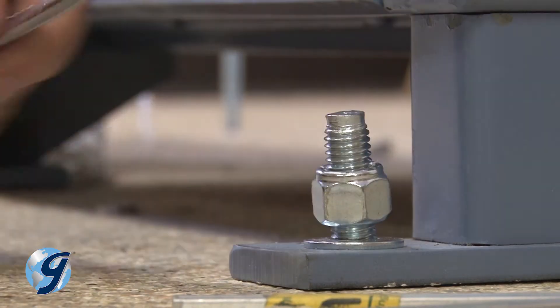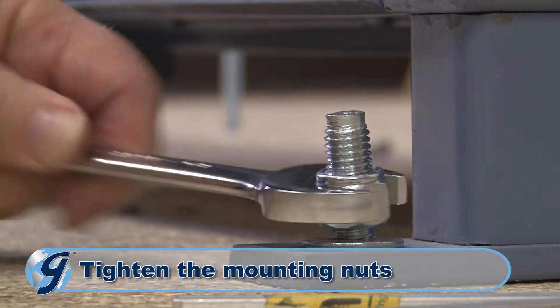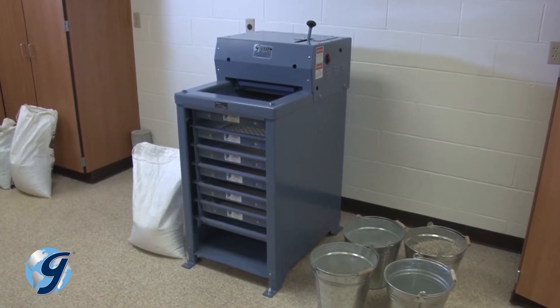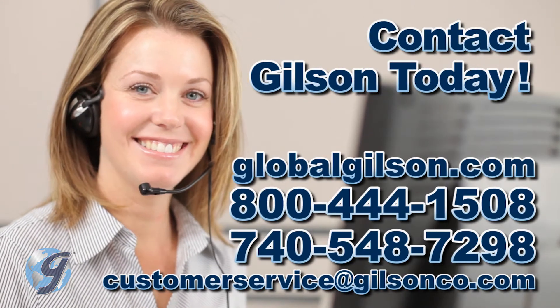Once the unit is level, tighten the mounting nuts to firmly anchor the unit to the floor. For any questions about installing your Gilson testing screen or for any Gilson product, please contact your Gilson technical support team.